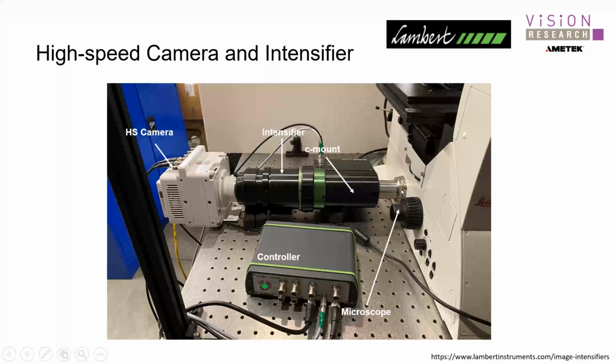So what this allows you to do is, as that image flows out of the microscope, this image intensifier will dramatically boost the signal that's coming out of the system. And essentially what you're doing is you're going from photons to electrons, you're amplifying the electronic signal, and you're putting it back into photons to project onto the high-speed camera here, and you're able to get really nice high-speed video, even when the events are considered a low light event, right?